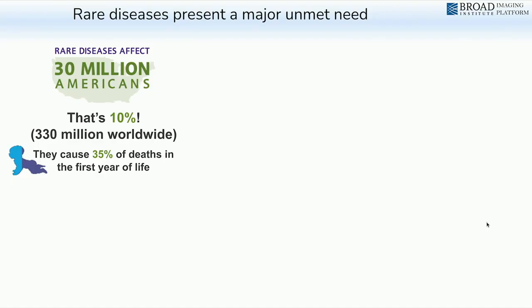And then the last example of how do we find phenotypes. So what have we covered? We've covered make a genetic perturbation if you know a gene that causes this disorder, look at patient cell lines with genomic risk if you've genomically sequenced them and you know a polygenic risk score that can predict the disorder, and then just take patient samples and just brute force patients with and without the disease, can we see a difference?